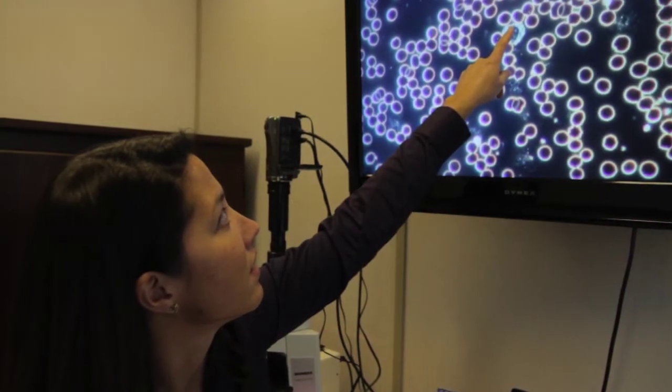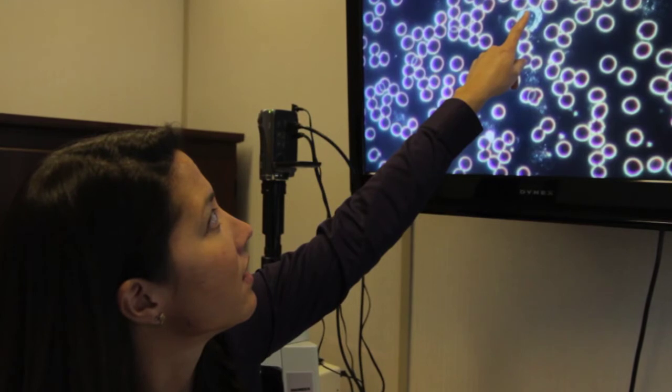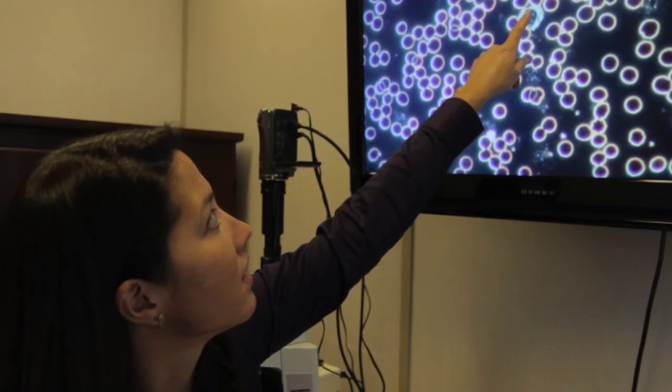What we do is take a prick at the fingertip and look at these live blood cells underneath the microscope. We magnify it to about 30,000 times magnification, so you're able to see it up on the big screen.